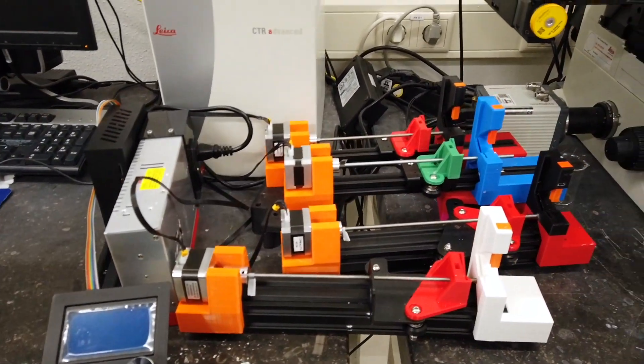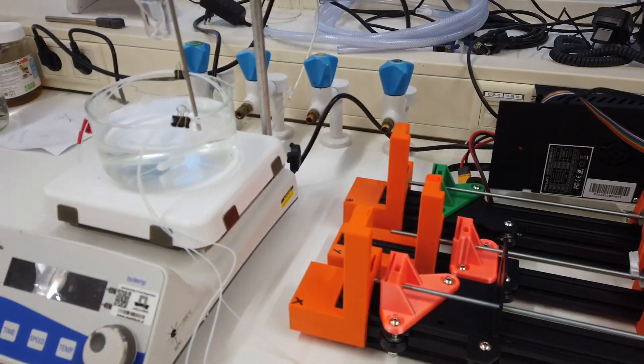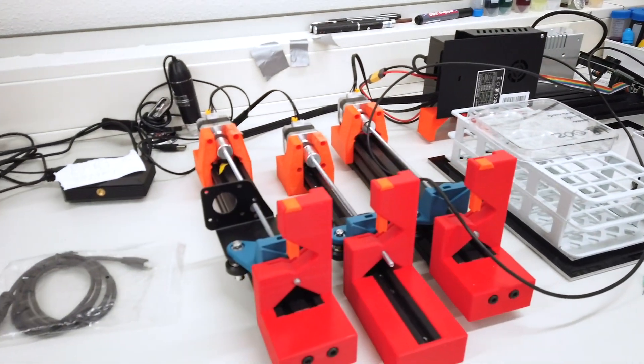We did syringe pumps and we are using them practically everywhere in the lab. As you can see here, near the microscope, near the hot plate, near the Raspberry Pi — practically everywhere. We have multiple sets.